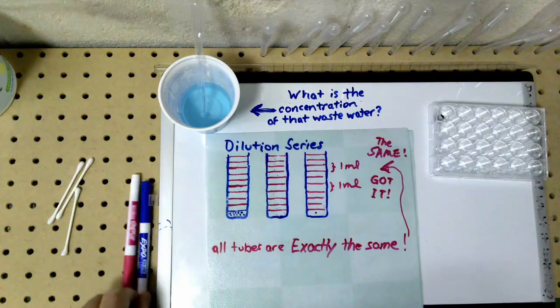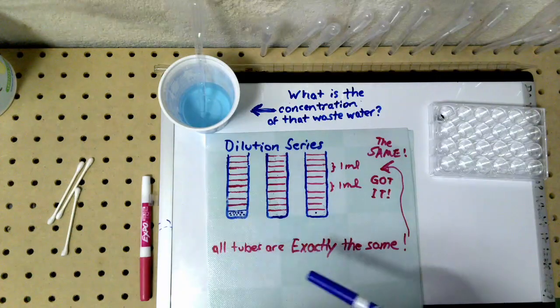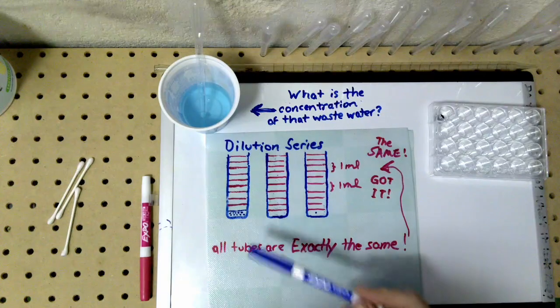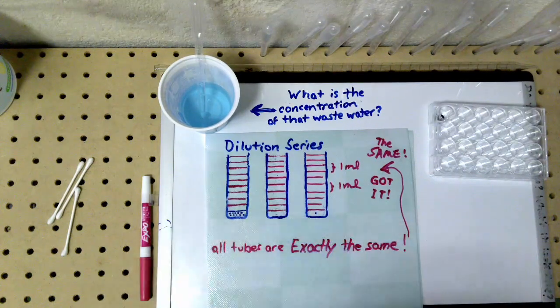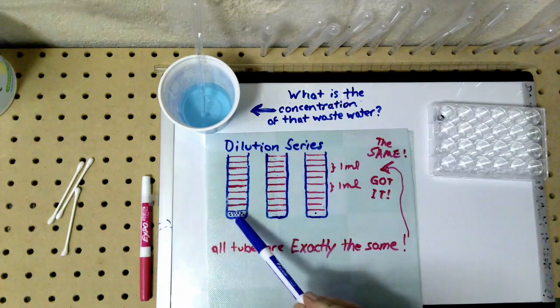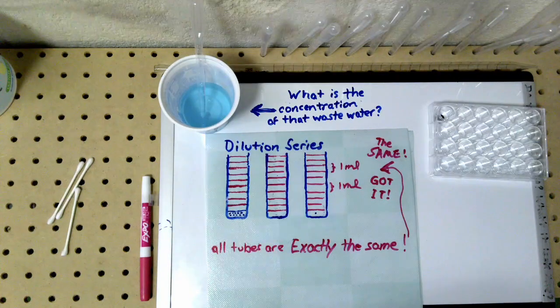And imagine that one drop is right here, and there's like 10 particles. We use 10 because it's an easy number. So there's 10 particles right there that make up that food coloring. And what I want to do is dilute it 10 times. So I want each of those particles to get 10 times further apart. That would be a 1/10 concentration compared to this.